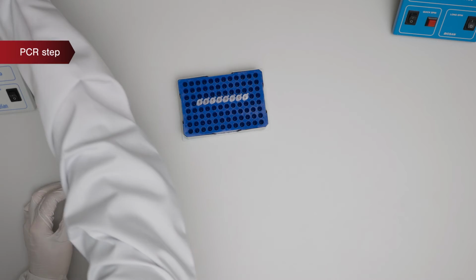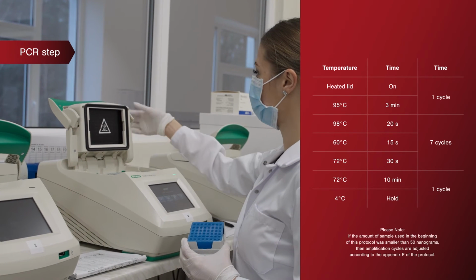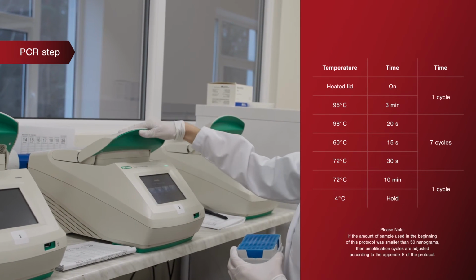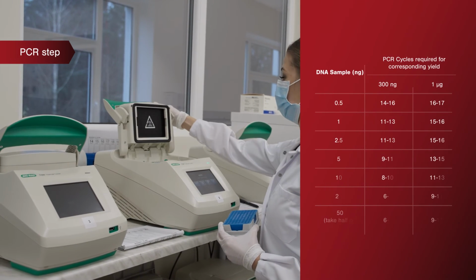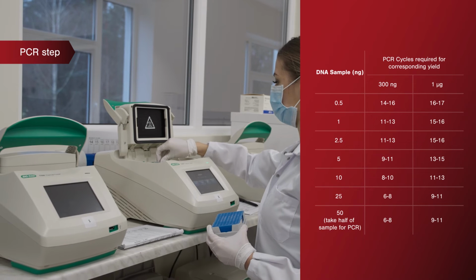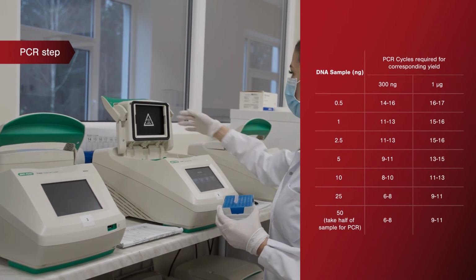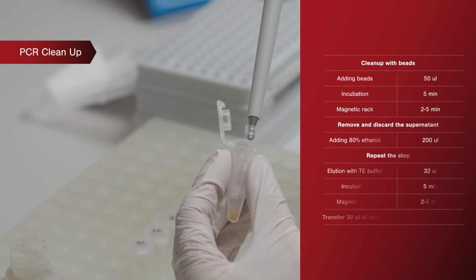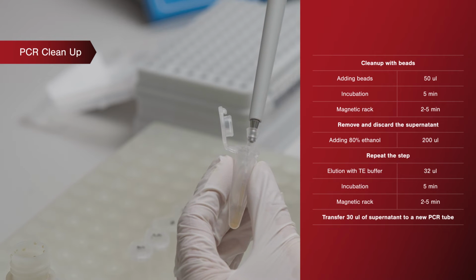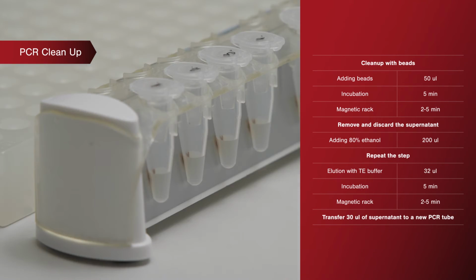Please note, if the amount of sample used in the beginning of this protocol was smaller than 50 nanograms, then amplification cycles are adjusted according to Appendix E of the protocol. After the PCR step, another cleanup is performed according to the previous description.